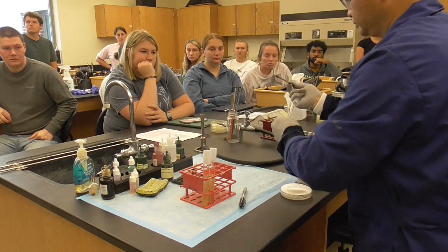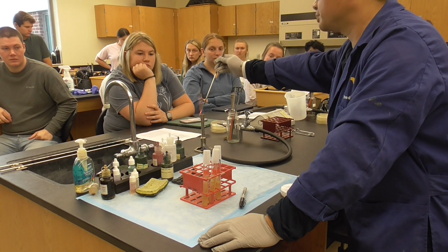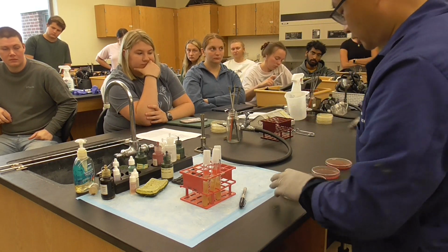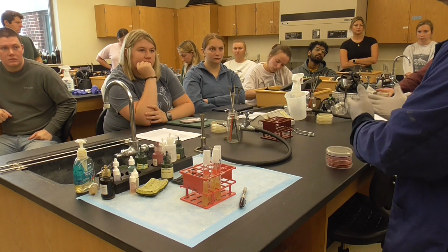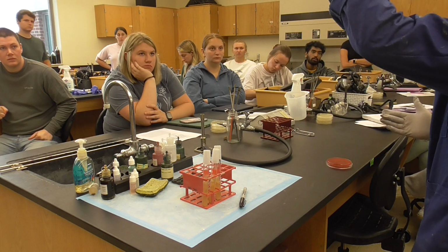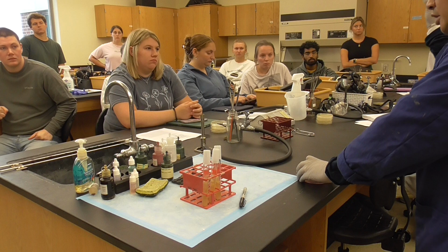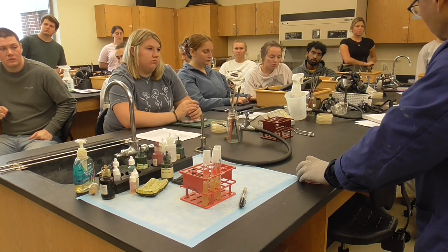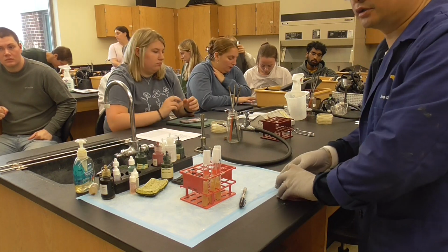Okay, that's all. And this is not looking for colonies. So keep in mind, this is not called streak plating. You can say it's called spot inoculation. This will be flipped over and given to the TA to do the incubation. We will see whether it grows or not on those three agars. Then we know the story behind it. And on this one we want to see alpha, beta, or gamma hemolytic. That's the purpose. It's not for isolating single colonies. So this is not called streak plating. This is called spot inoculation. Okay, so very good. You can go ahead and do it.